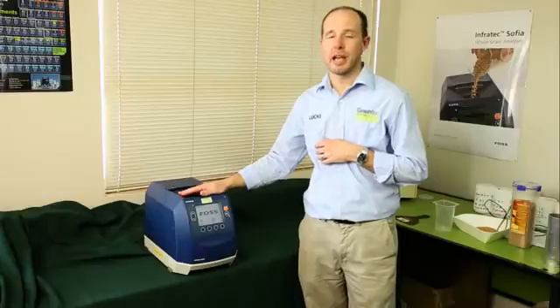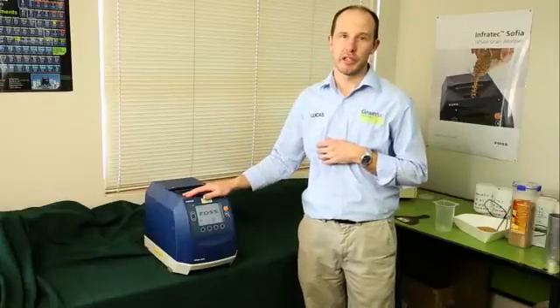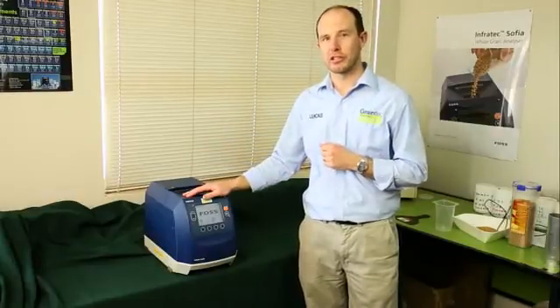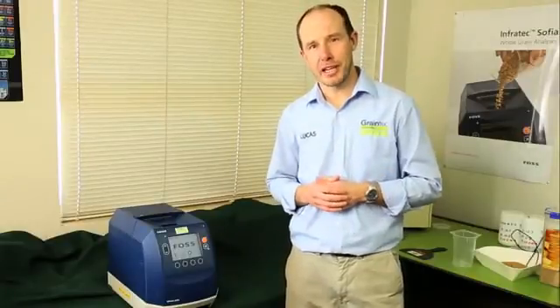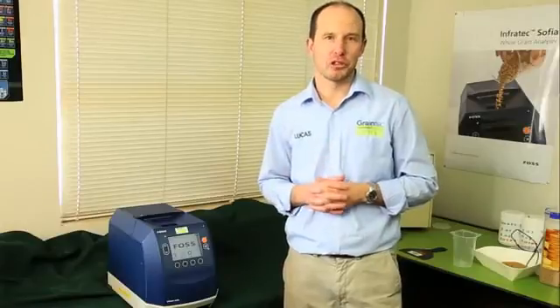Measuring with FOSS on-farm and measuring with FOSS at your point of delivery means you don't get any surprises. That's a little bit about the FOSS Infratec Sophia from me, but you can see what some of our customers are saying with some of the other videos.